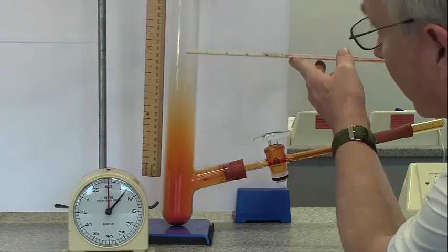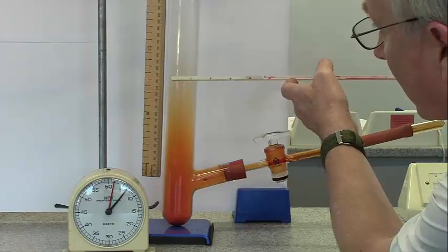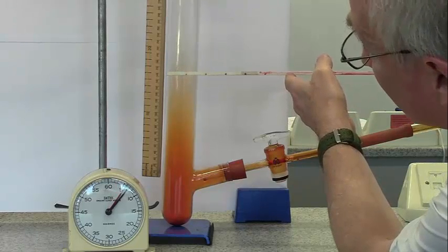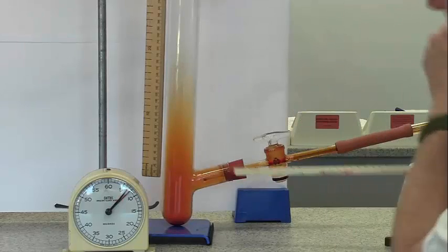And now after six minutes, we're around here - about 15 to 16 centimetres.